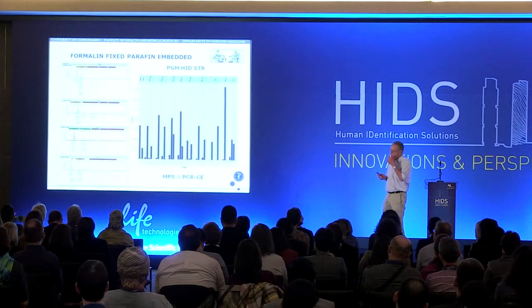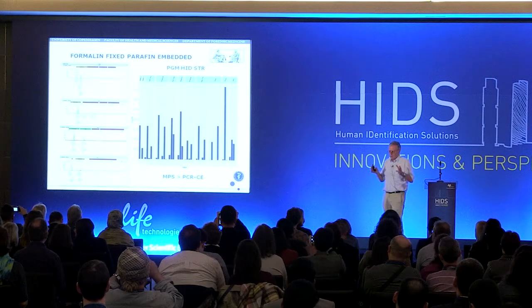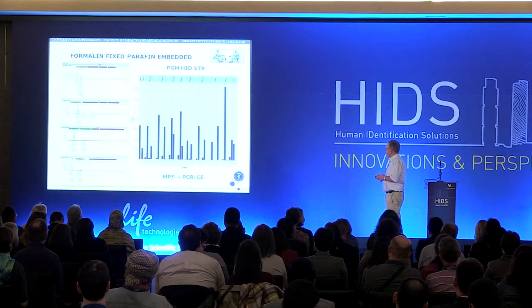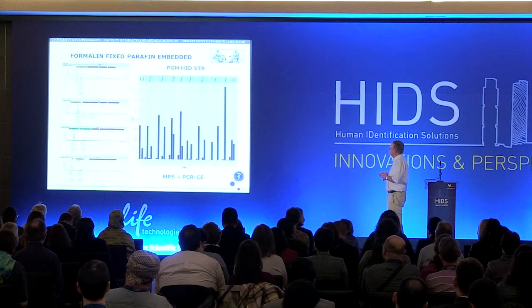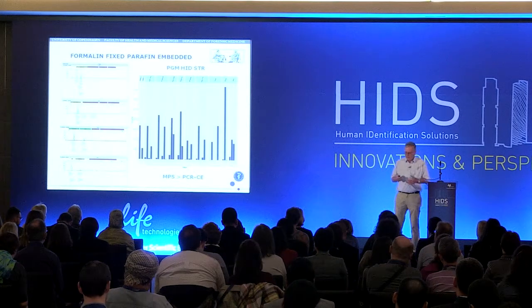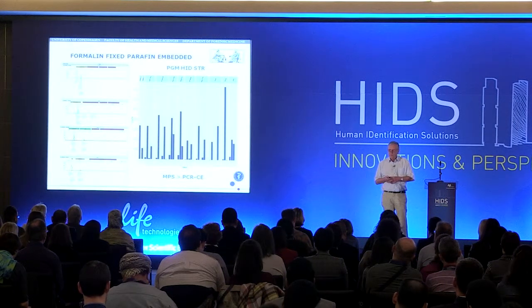If we go to the NGS, the primers have been moved closer to the repeat regions, and here you can see that there are results with all the systems, all 9 systems, and amelogenin. So again, it's a significant improvement of the results.